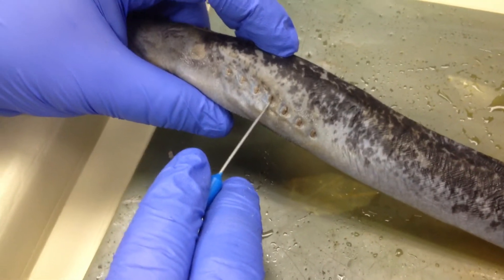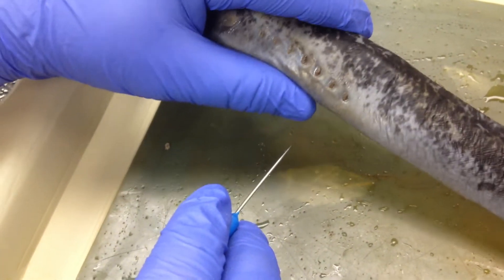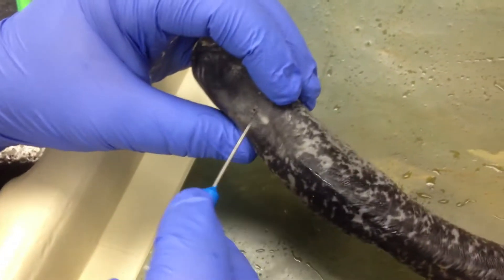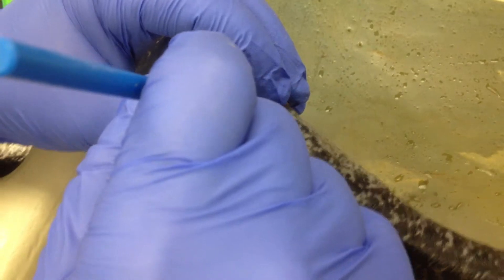Starting off, we have the gills, and if you squeeze it, you can actually see the breath action up top. Nostril.